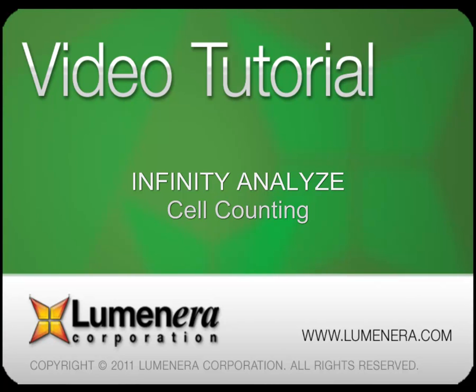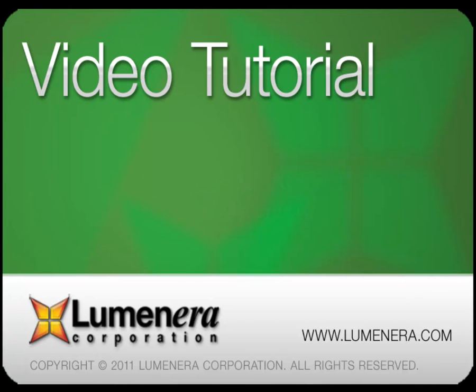This instructional video is part of the tutorial series for the Infinity Analyze microscopy software. A new cell counting function has been added to the package with release 6.0. In this session, we'll show how to use this function and take a look at a couple of other small features added to Analyze 6.0.